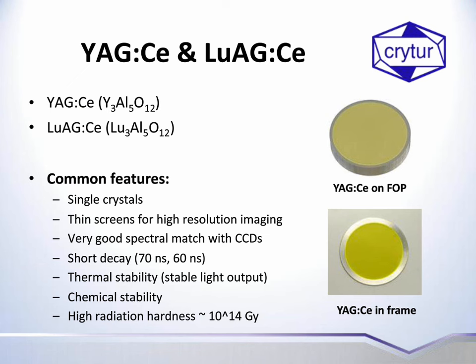Which is very high. These can be manufactured in different configurations, such as on a fiber optic plate, or they can be fixed in a frame. So these scintillators can then be coupled in various ways to a detector.